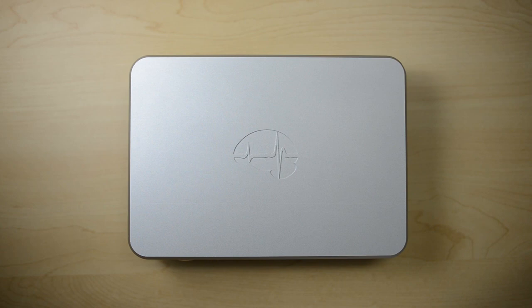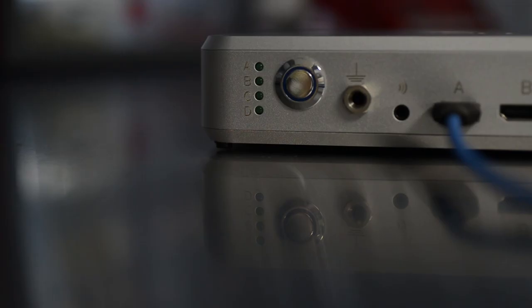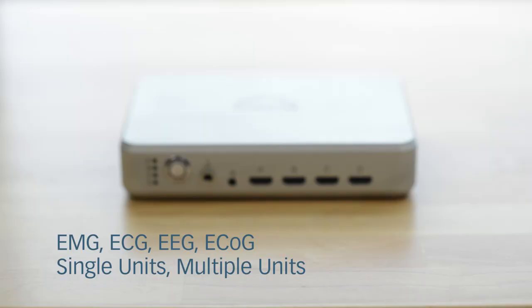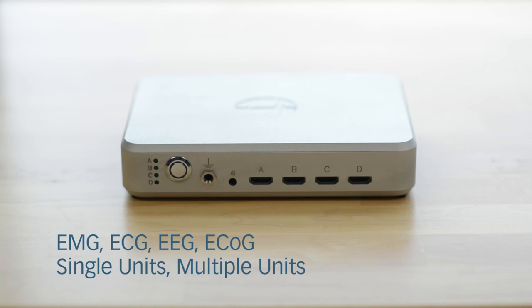The Neuronexus SmartBox is a fully featured, high-performance instrument for neurophysiology and experimental control. Neuronexus has reimagined a conventional rack-mounted workstation as a portable, ready-to-use system.